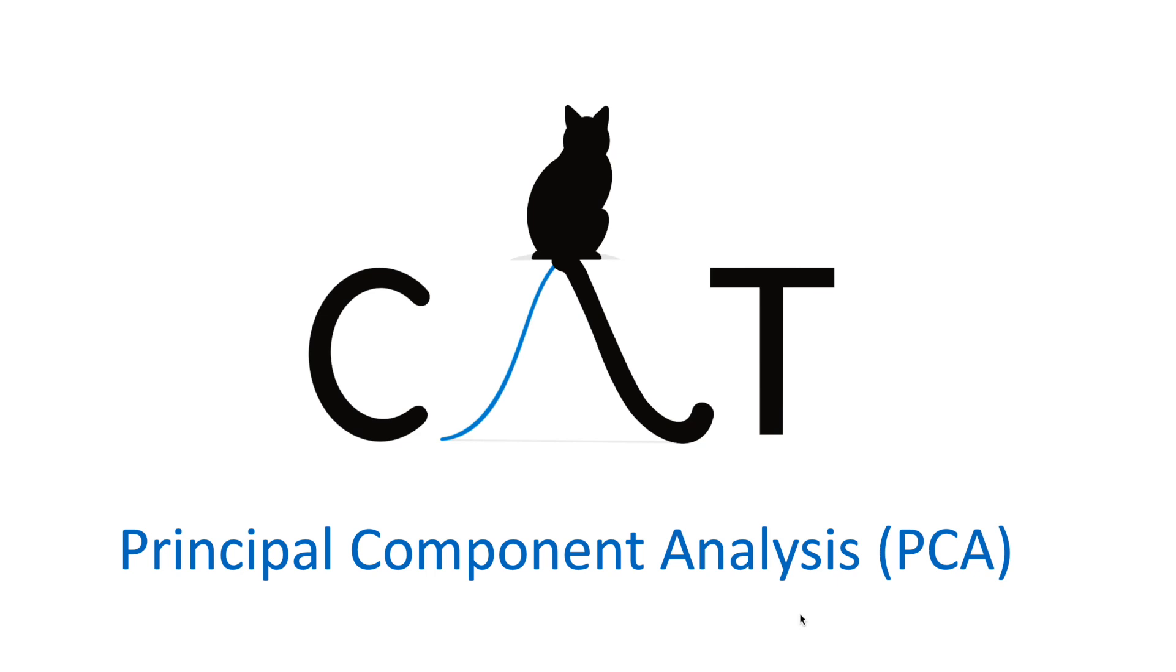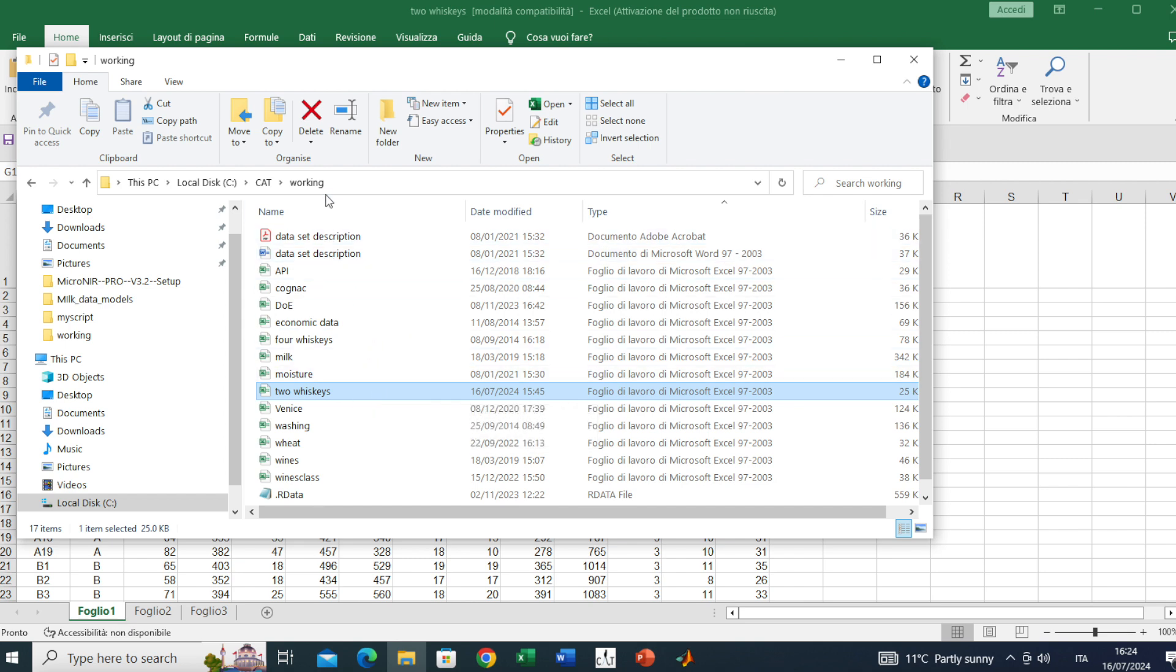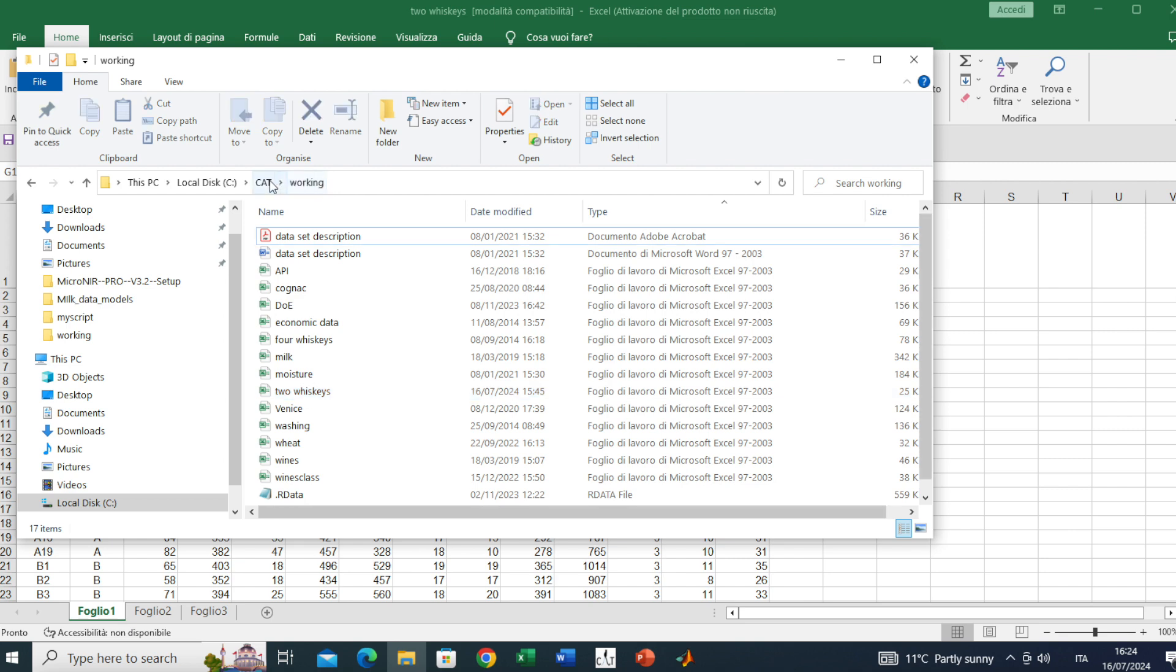Hello everyone, in this video I will show you how to perform PCA using the CAT software. Let's start off by using the two whiskey dataset. Just to remind you, you can find it in the working directory inside the CAT folder.